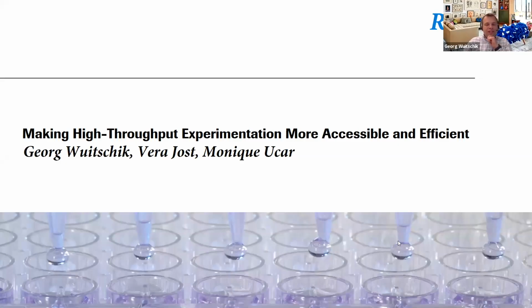So today's talk should be about how we as Roche approach high throughput screening, in that we'd like to have a model that serves all the way the value chain from medicinal chemistry to late process development.